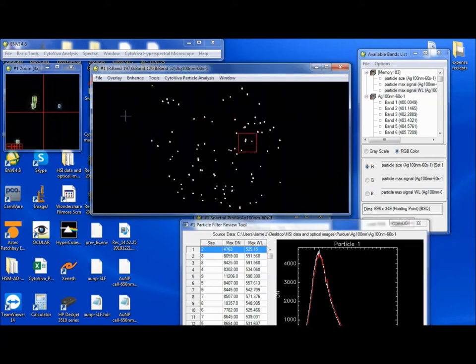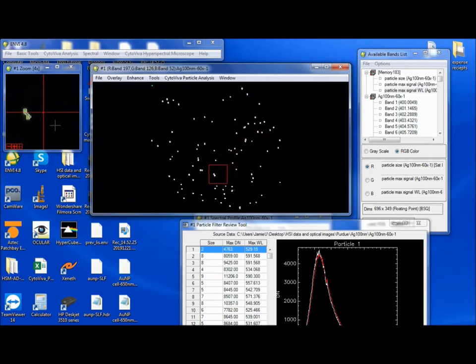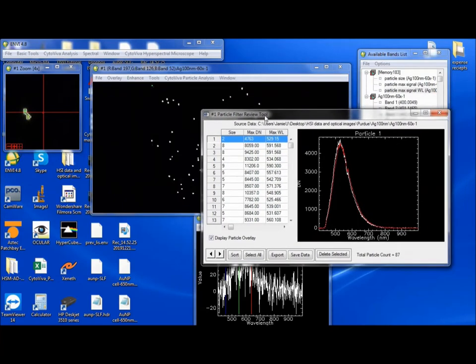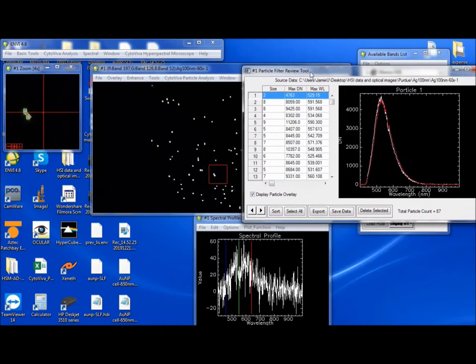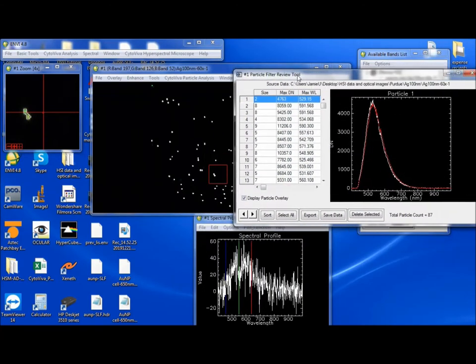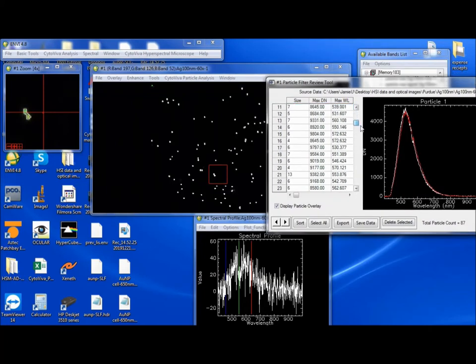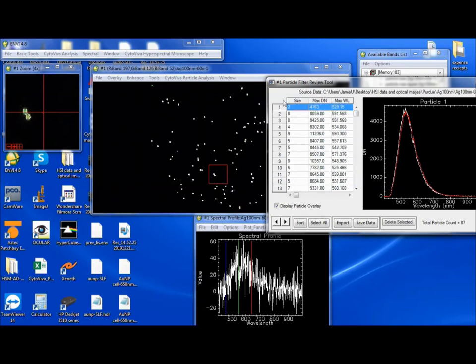Also, what you'll notice is that it counted this as one particle. This is sort of an aggregate here. And down here it counted this as one particle. These are actually probably so close to each other it's probably impossible to have these actually separated. So what this table does for us is it shows us how many particles. And then there's a list. So it's particles. There's 87 particles. So it starts at particle one. It goes down to particle 87.